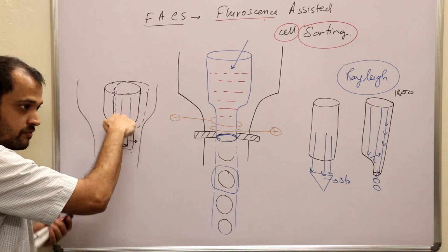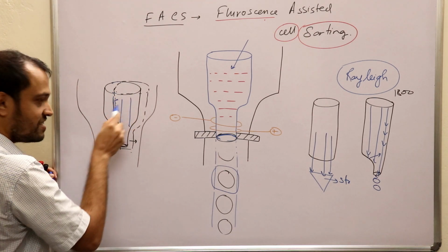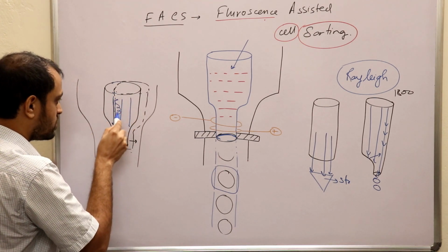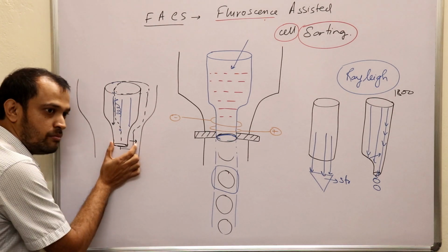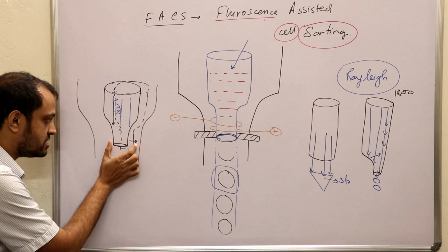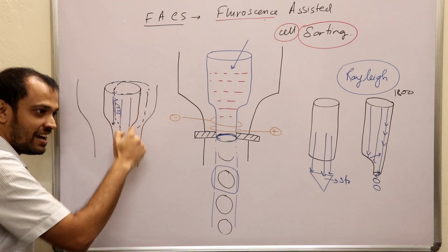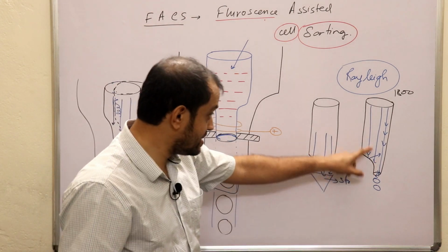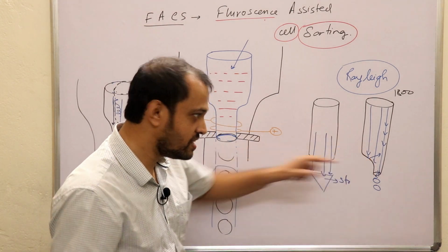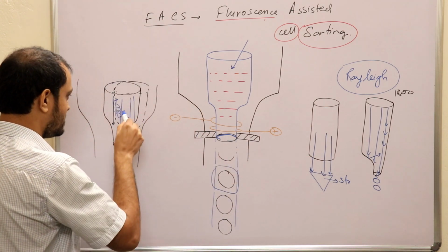or this particular flow of fluid which was coming uniformly, will now interact with this wall and become turbulent. Then in another moment I will shift it from here to here, and this fluid will become turbulent, and due to this turbulence a nozzle-like thing will be formed. Here was turbulence and here also there are two turbulent streams, right?